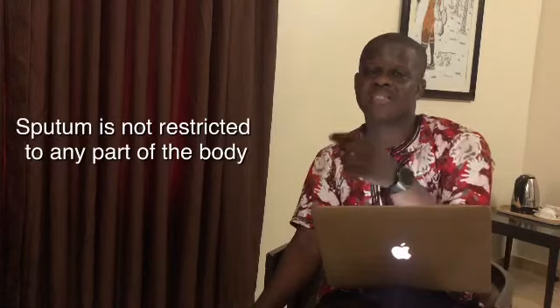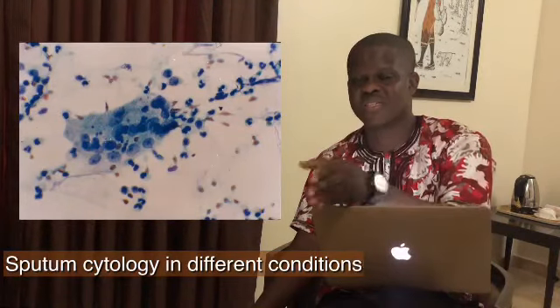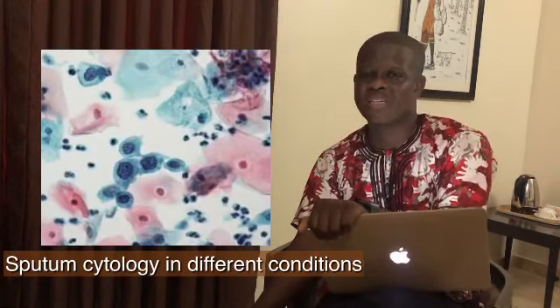And except you are really good at cellular morphology and how individual cells look, the distinguishing features of individual cells, you may not be able to categorically state that this cell that we've identified in the sputum is actually from this part of the tract or not. So that is one of the drawbacks.